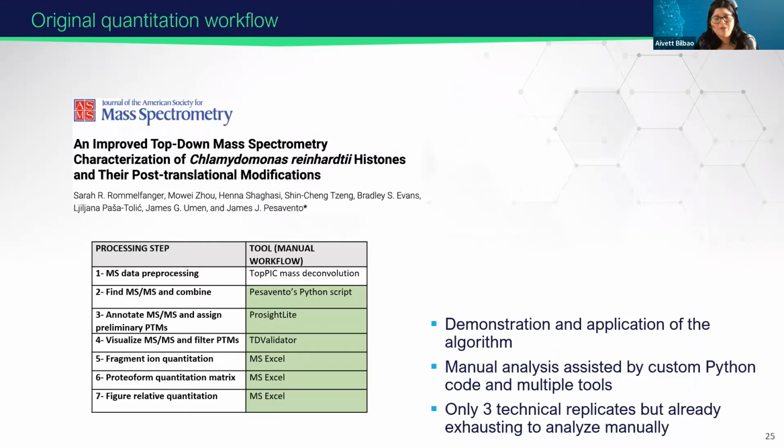Particularly last year, our collaborators demonstrated the use of this approach in their publication to characterize histones.